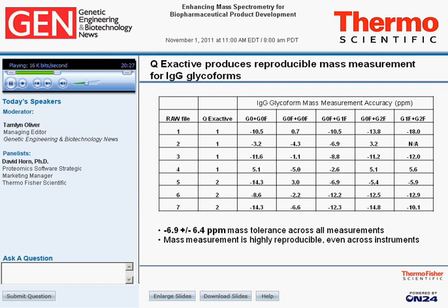This is kind of interesting because it's actually rather difficult to calculate a theoretical average mass. It depends on the carbon source where you grow the protein as to what the average mass will actually be. Any minor change in the carbon-12, carbon-13 ratio can change the mass of the protein by upwards of 1 Dalton at least, if not more than that. So that minus 7 ppm may just be due to the fact that we're using average masses for a protein that has a slightly different source of carbon than what we use to produce the theoretical masses. So again, we think that 6.4 ppm spread is a more realistic indicator of the mass accuracy. And further, we've run plenty of peptide and small molecule samples on these machines, and we do not see that 7 ppm offset. Next slide, please.